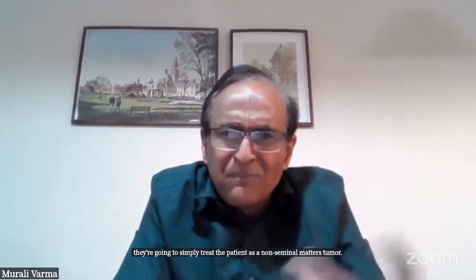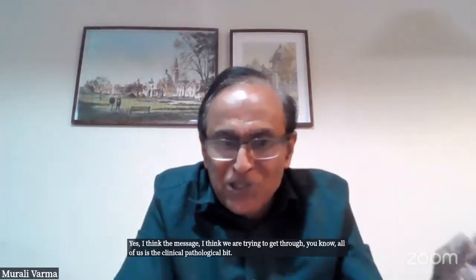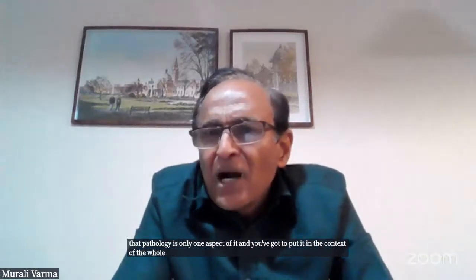Yes, I think the message we are trying to get through, all of us, is the clinical-pathological bit. That pathology is only one aspect of it, and you've got to put it in the context of the whole case. How would you measure a cystic tumor?